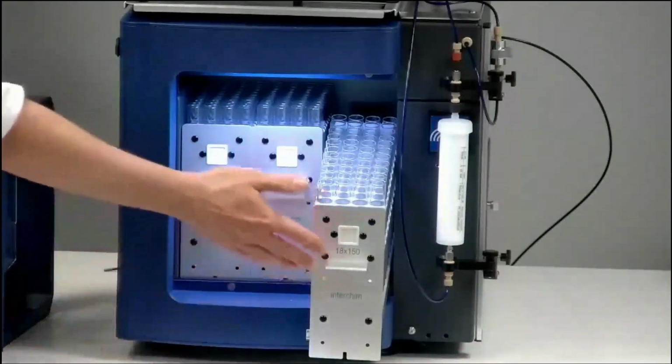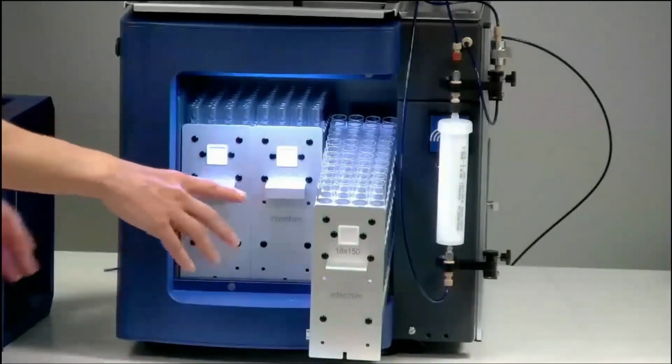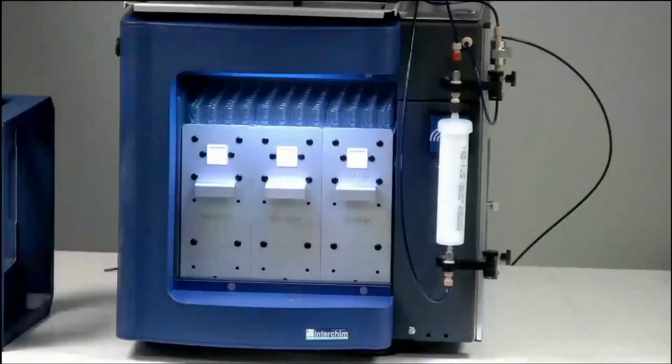But you can choose to put smaller tubing from 9 ml to very high capacity, like bottles of 250 ml. And for very large collection, you can also use a funnel connected to a big tank. And of course, you can mix the size of the racks inside the instrument.